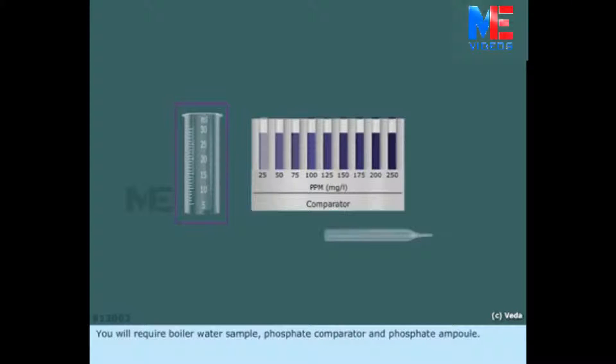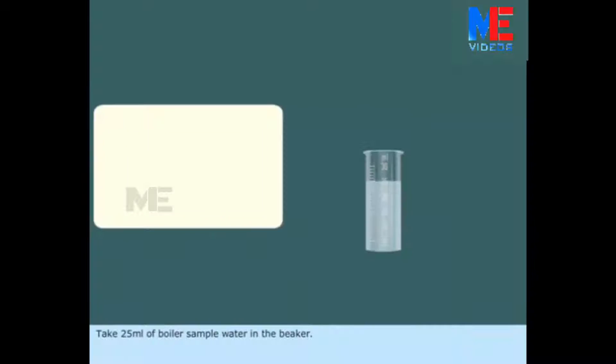You will require a boiler water sample, a phosphate comparator, and a phosphate ampoule. Take 25 ml of boiler sample water in the beaker.